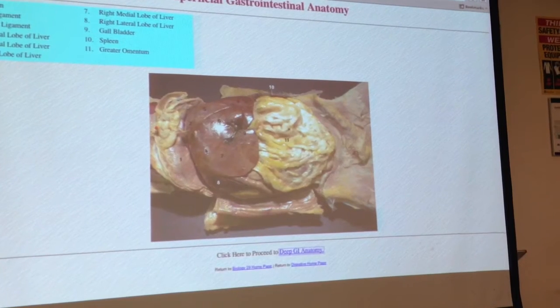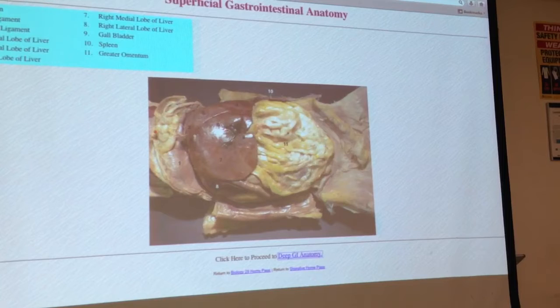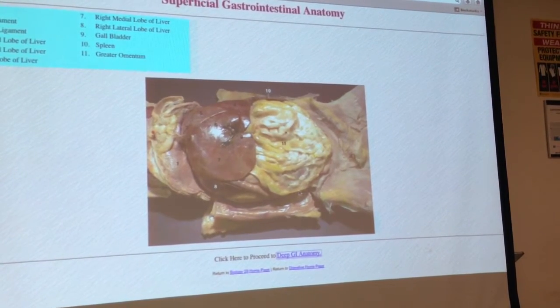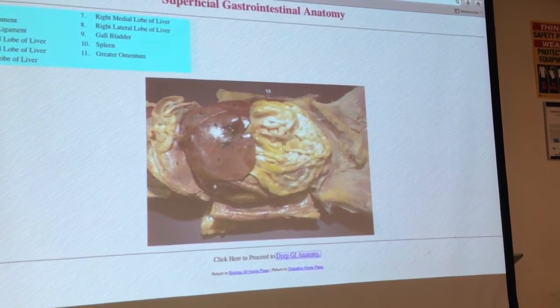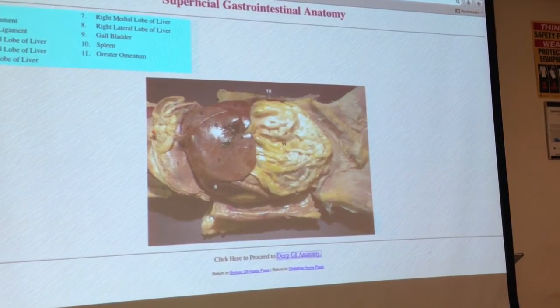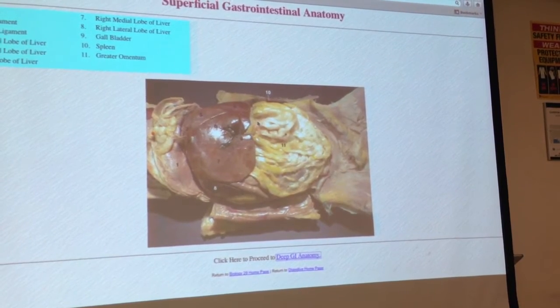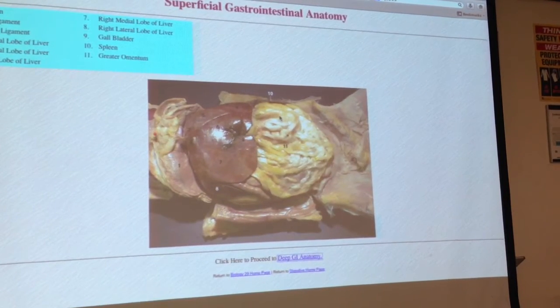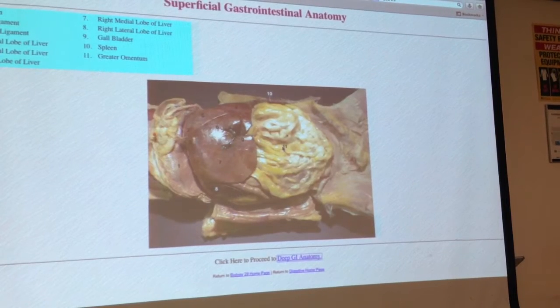I'm going to take a moment and use this view to talk about some of the membranes. When you opened it up, I told you not to touch the big fatty membrane. That's the greater omentum. Okay? So now that we're getting into the dissection portion, we need to see what's underneath it. The best thing to do is gently pick it up, starting at the edges, and work your way over. It's going to be pretty embedded and tucked into those small intestines, so try to keep it intact, because as soon as you get a couple of rips in here, it just wants to fall apart. Okay?